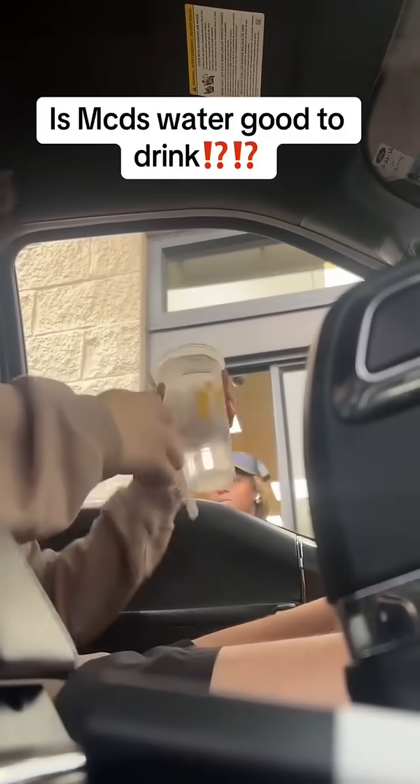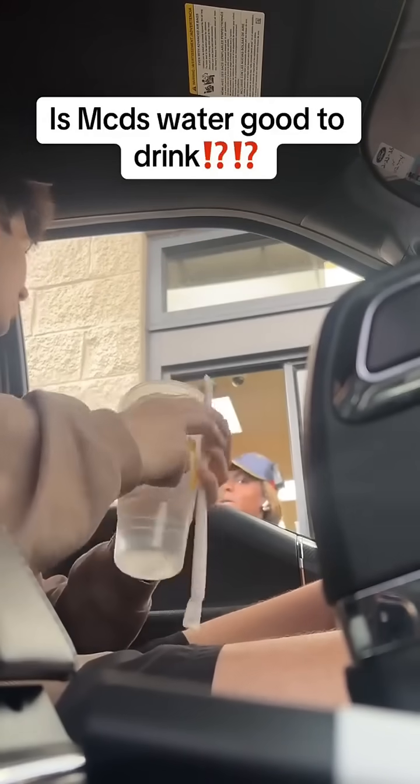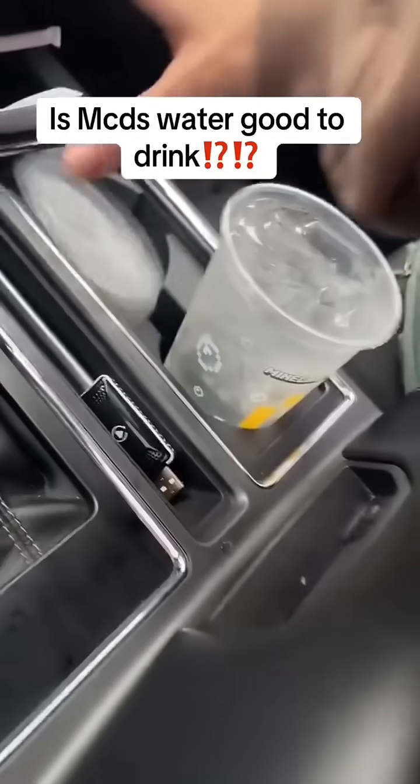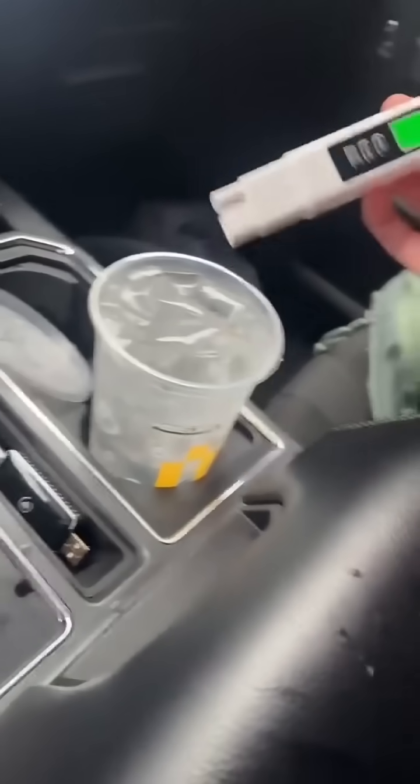Thank you. Do you know, is this just tap water? I believe. Not sure. Okay, I appreciate you. We're testing it and finding out right now. So this is some of y'all's favorite restaurant. We're going to use this new water tester I got and just see how bad their water is. It might be good, actually.